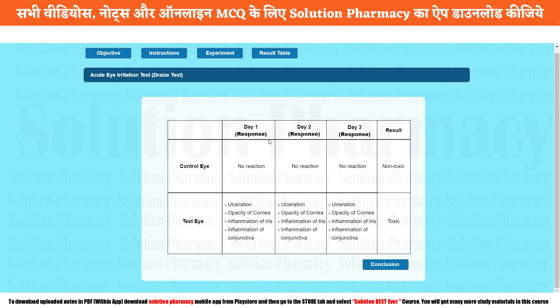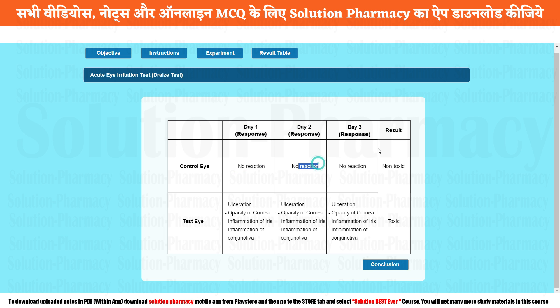If you click the result table, there is the following observation. For the control eye: day one — no reaction; day two — no reaction; day three — no reaction. That means it is non-toxic, as the right eye remained unchanged. On the second tab, the test eye shows different types of appearances — ulceration, opacity, inflammation of the iris, inflammation of the conjunctiva, or a combination of any of these. The same response is seen on day two and day three, which concludes that the particular given drug sample was toxic.